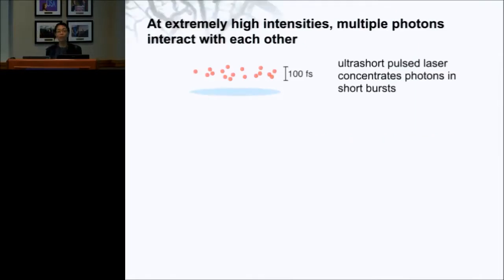The field of nonlinear optics has to do with extremely high intensity, very powerful lasers. The whole principle behind this is that when you have very high intensity lasers, you can pack them into such a state that you can get lots of photons to start interacting with each other. Then you can get things like fluorescence that I'll show you, and manipulation that's not possible, and you can go below the surface. The basic principle is this: you want to get as many photons as you can so that you get a density at which they'll start to collide with each other and whatever other material you have.